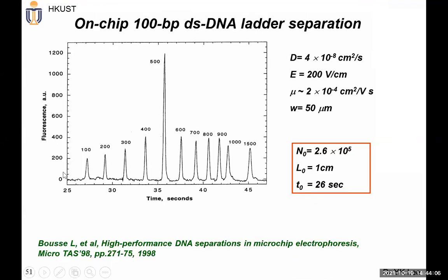So this microfluidic, microelectrophoresis device can be used for separation and analysis of DNA mixtures, for example a 100 base pair double-strand DNA ladder.